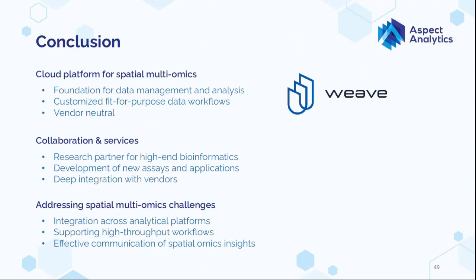But in conclusion, we provide a cloud platform for spatial multi-omics with a rigorous standardized way to integrate across assays, to integrate across omics layers acquired on serial sections. And we've applied this to many different use cases with good results.